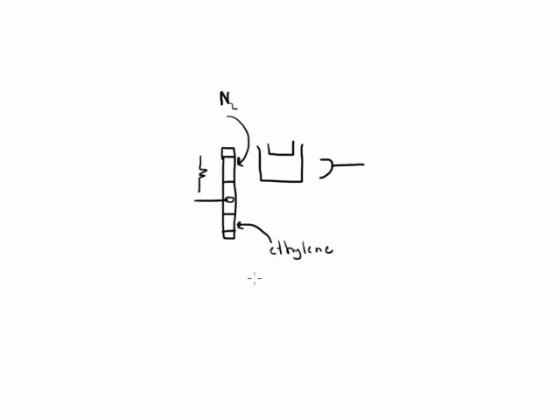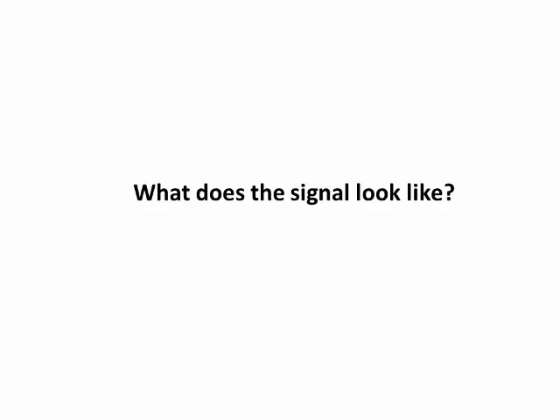Now, once we have our gases in there, we'll talk about how the signal is processed. What does the signal look like from each of these gas filters when the analyzer alternates between them? On the left side of the screen, we're going to have zero gas in the sample cell. On both the top and the bottom, zero gas goes into the sample cell, and we'll draw what the signal looks like. Over on the right side of the page, we'll be talking about span gas. It will look similar for a sample gas as well.